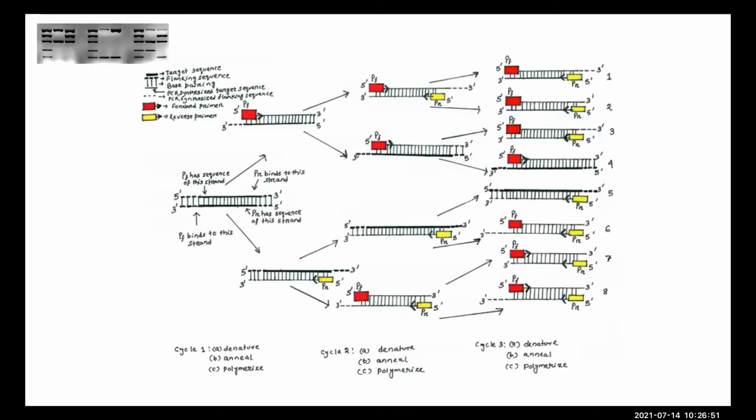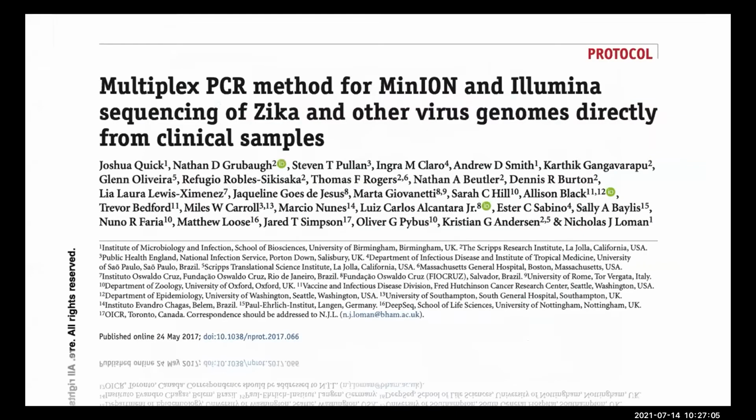As I said, we use PCR amplification. It's an exponential amplification process, and it's very simple, it's very robust, and it's been around for a long time. So that's one of the advantages of doing something like this. It provides you inbuilt enrichment because any host material that was in your sample is going to be dramatically swamped because of the amplification of the target fragments.